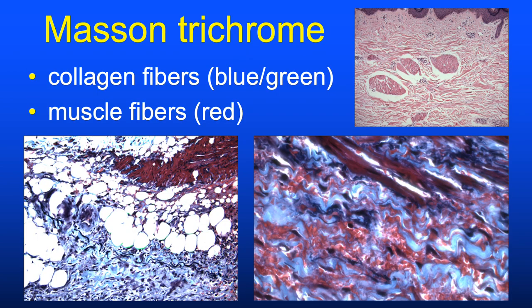The Masson trichrome helps distinguish collagen fibers from muscle fibers as may be encountered in the dermis. Conveniently, collagen is blue-green and muscle fibers stain red. In practice, I order this stain about once every five years, usually just for teaching purposes.